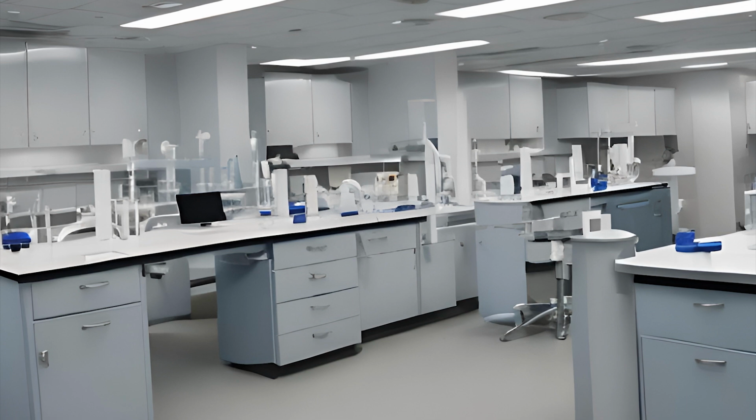If you need to store your samples, you always want to pour them off and not just let them sit on gel. Prompt delivery and separation will minimize the effects of metabolic processes, such as glycolysis, unless those processes are chemically prevented, such as using sodium fluoride to inhibit glycolysis.